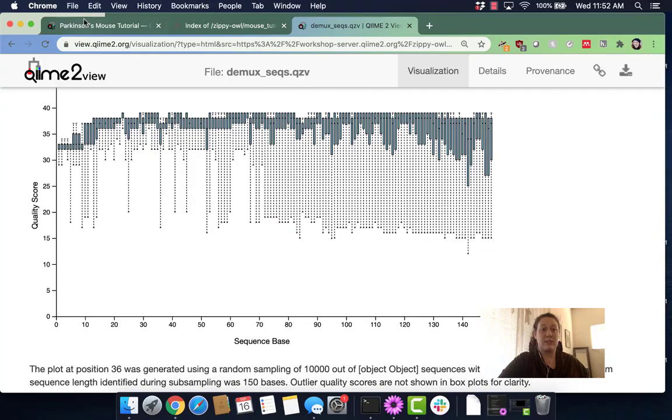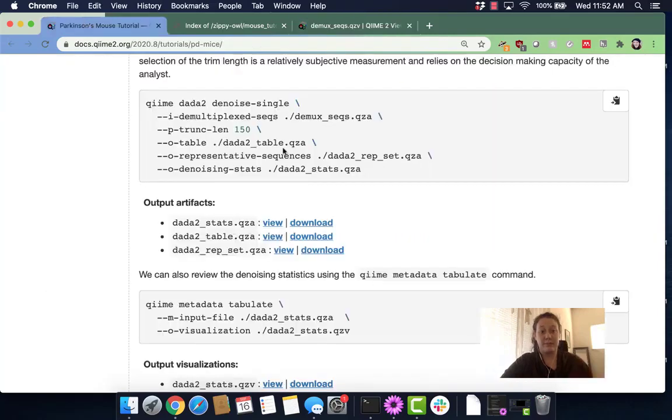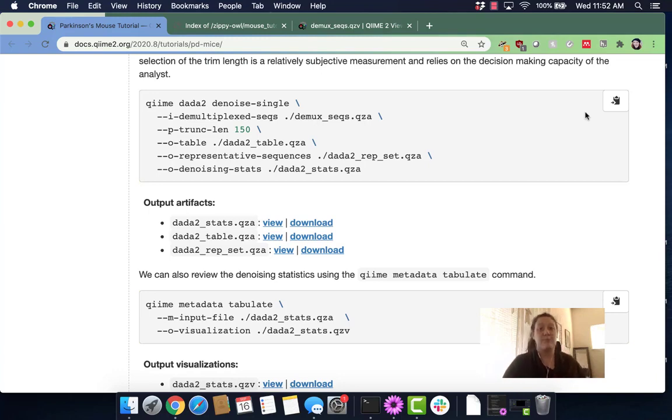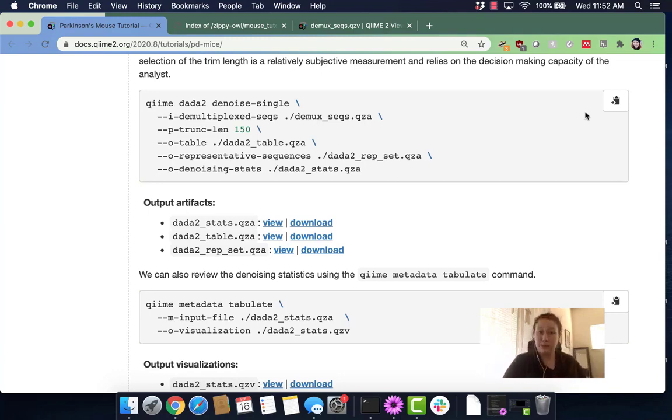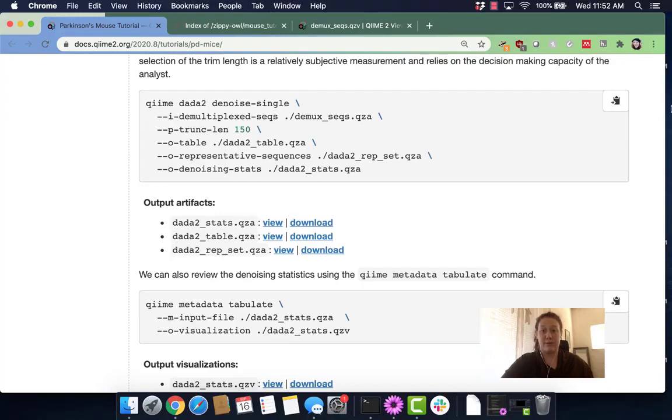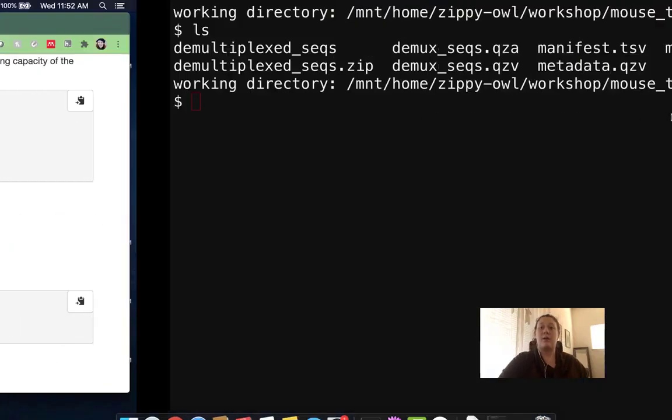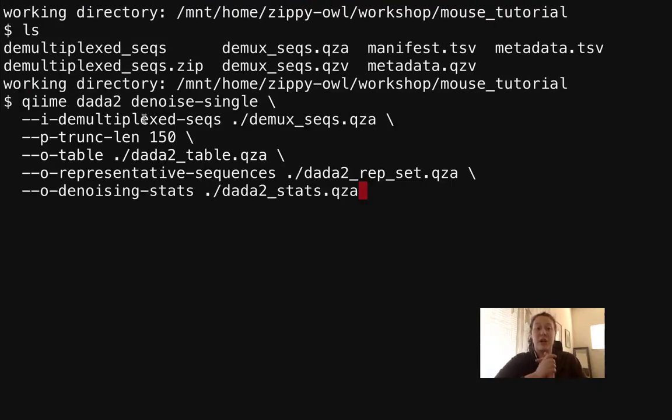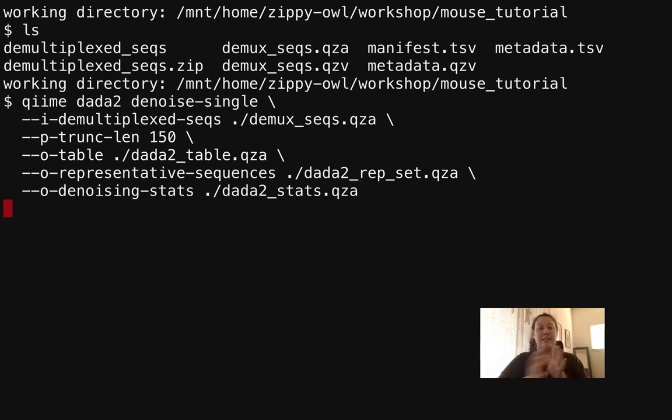So let's go to this tutorial again. Here is our DADA2 denoise single. Now that we've decided where to truncate, we're going to run this. It takes a while to run, so as it is running I'm going to discuss what we've inputted and what will output from it. First I'm just going to run it because it takes a minute to run. We got it all in there, press enter.